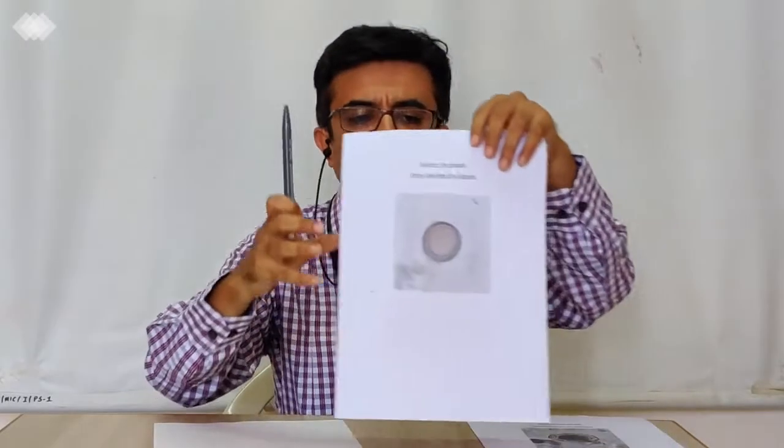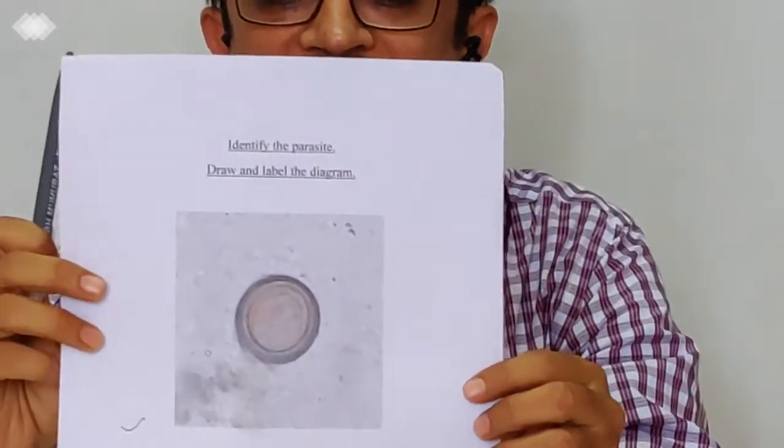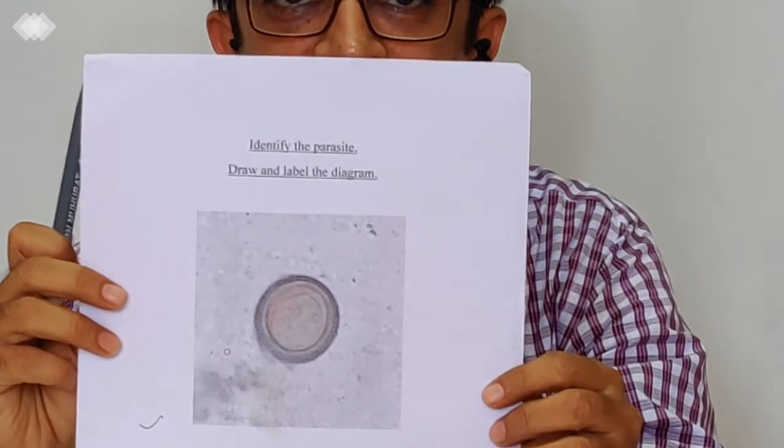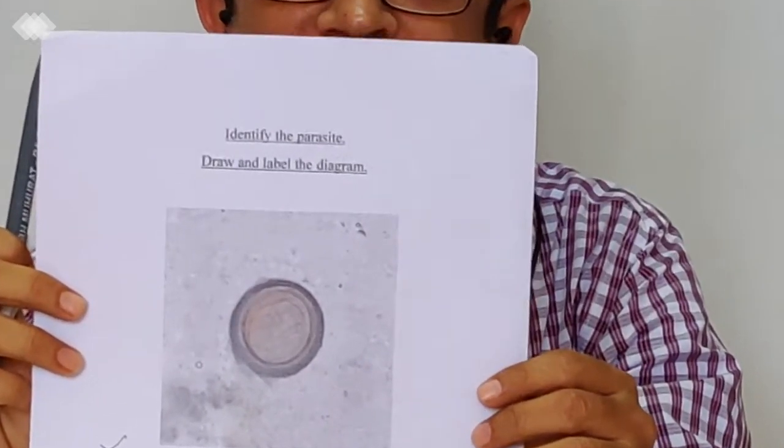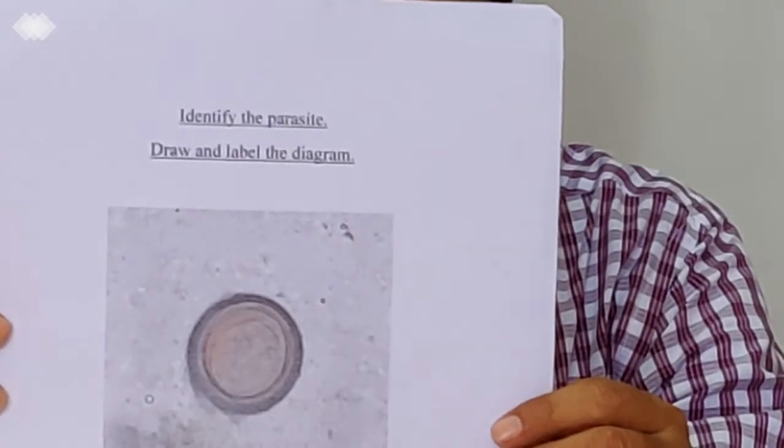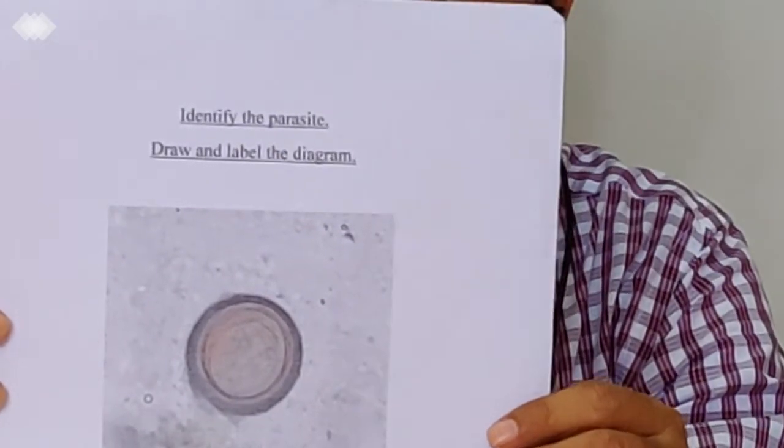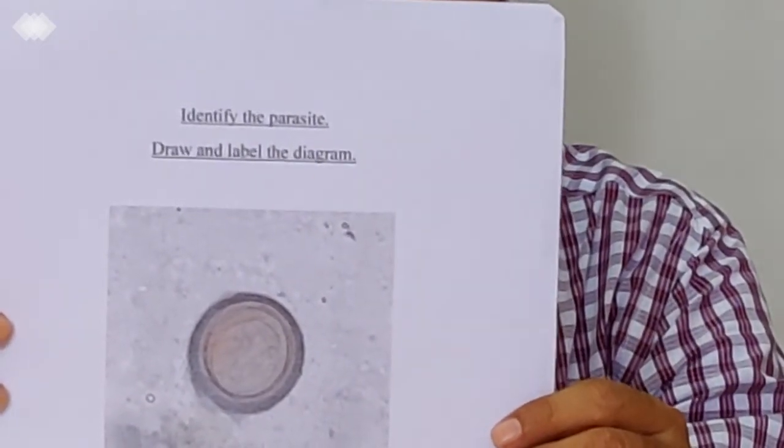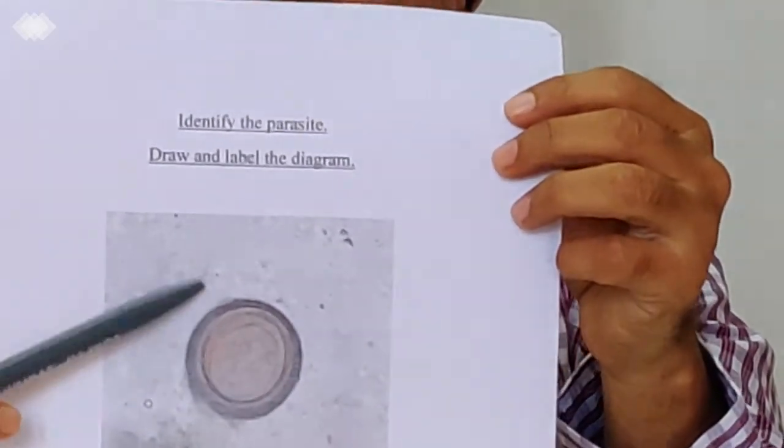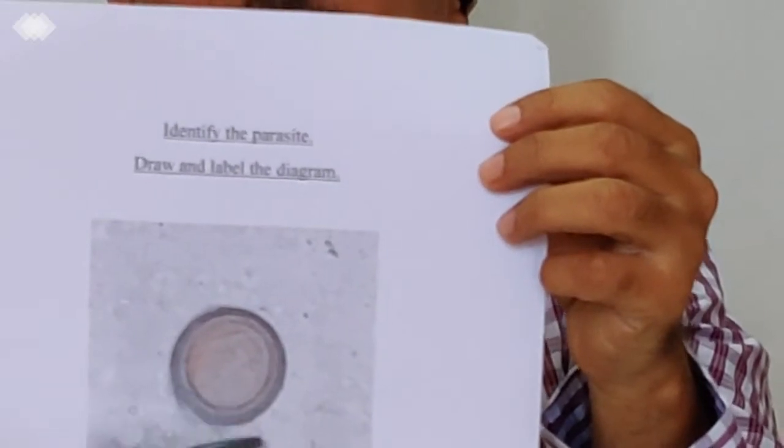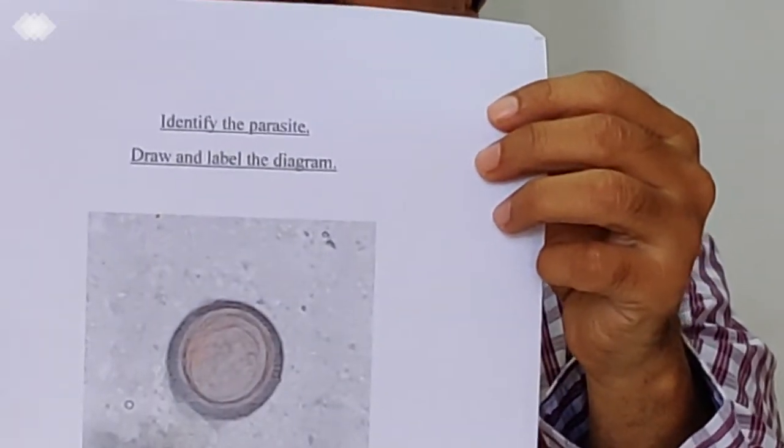Now, if we see one by one, the common eggs which we encounter. This is Taenia, the egg of Taenia. Here, by looking at the morphology of egg, you cannot discriminate between Taenia solium or saginata. Both would look same in that it would be bile-stained. There would be radial striation which would be visible in the high power of the microscope.